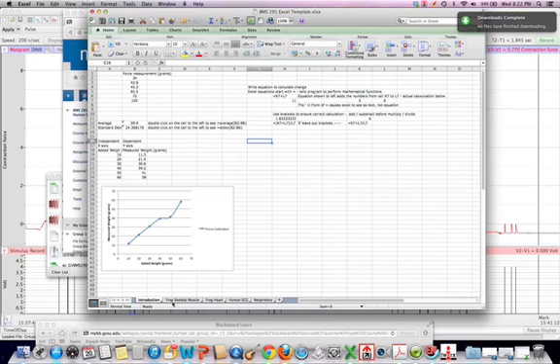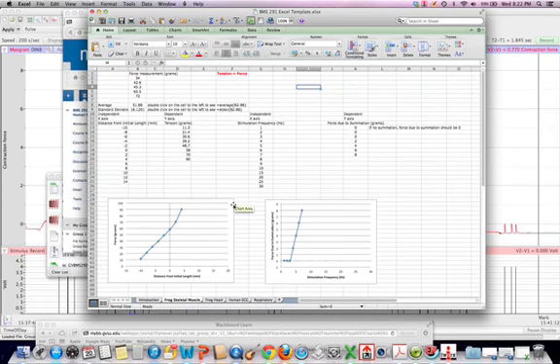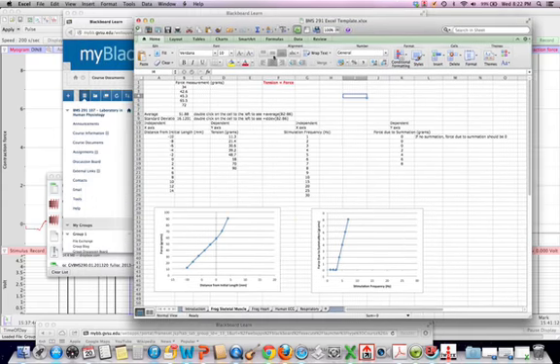And look down at the bottom, you can see different tabs here. Intro, which is the same thing that we used for our last calculations. Frog Skeletal Muscle is shown here, and you can see the different types of graphs that you can put in here. Force measurement, you can use this to calculate your different averages if you like. Tension is equal to force.